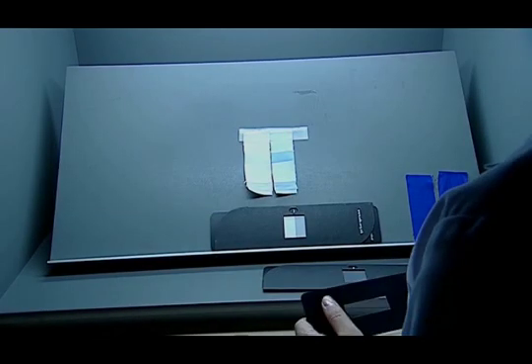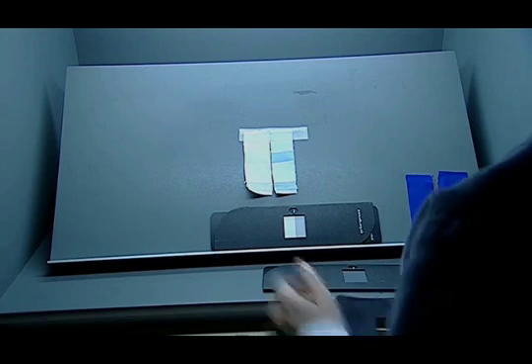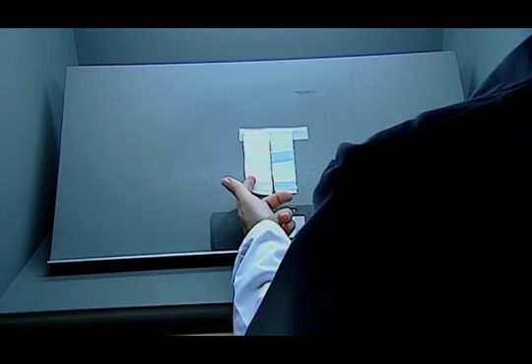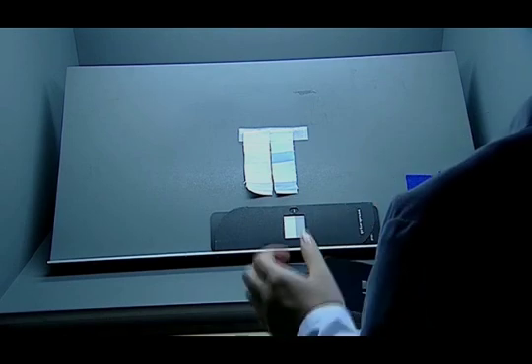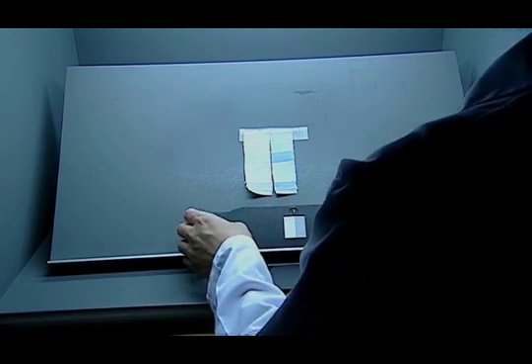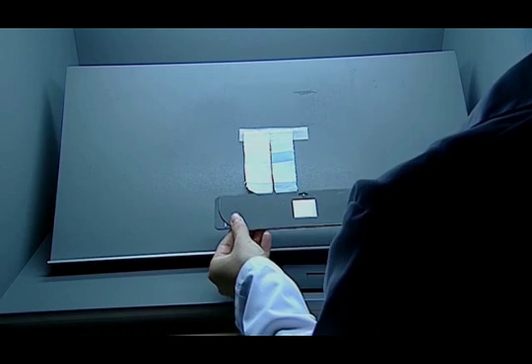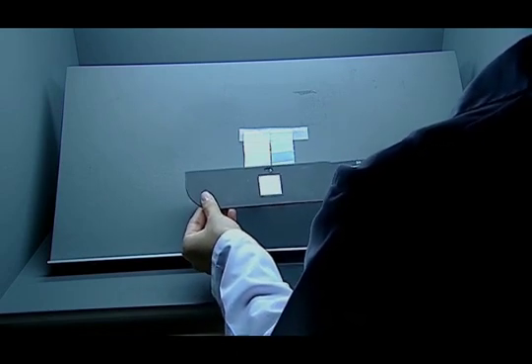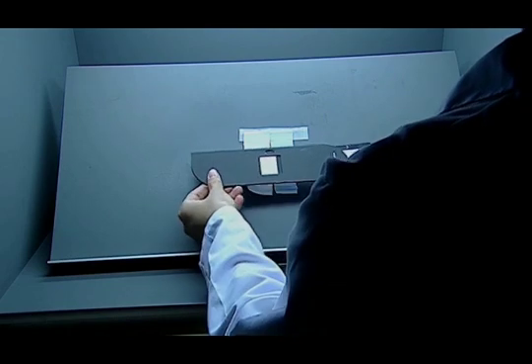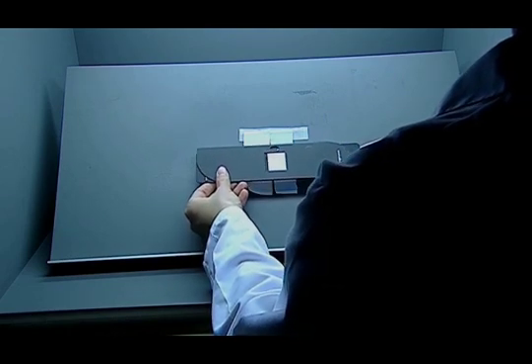To evaluate the colour fastness against the washing test, the original sample is put on the left side, and the tested sample is put on the right side. The staining is evaluated with the grey scale. The grey scale, which has levels from 1 to 5, is placed on the tested sample, and the appropriate level is found.